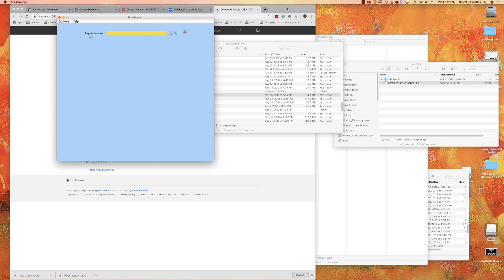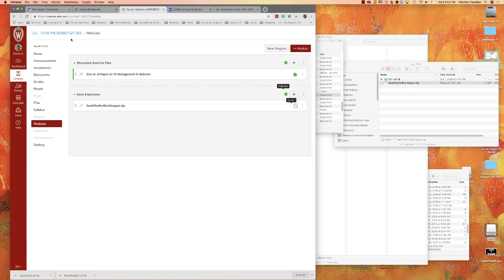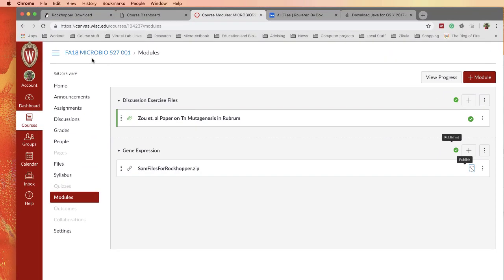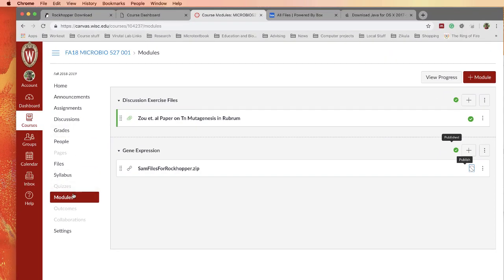Now the other thing we need is the files that we're going to analyze — these are RNA-seq data files and they're huge. They have thousands and thousands of little sequences of different RNAs that were expressed by organisms under different conditions. We're going to do two of them. I have all the data you need over in courses — if you go to the Microbio 527 website and click on modules, you'll see one called gene expression.